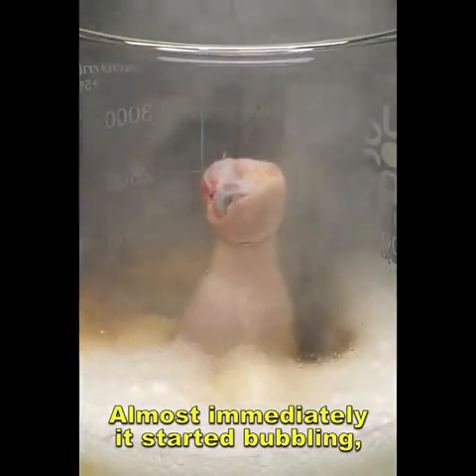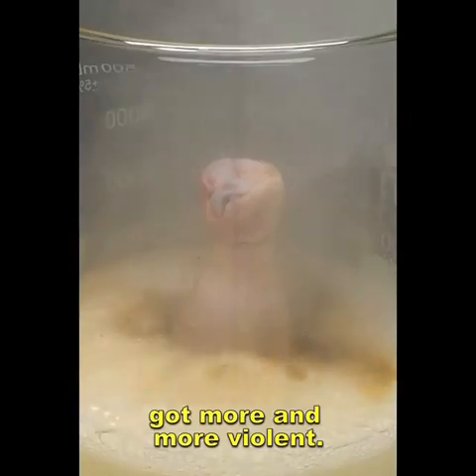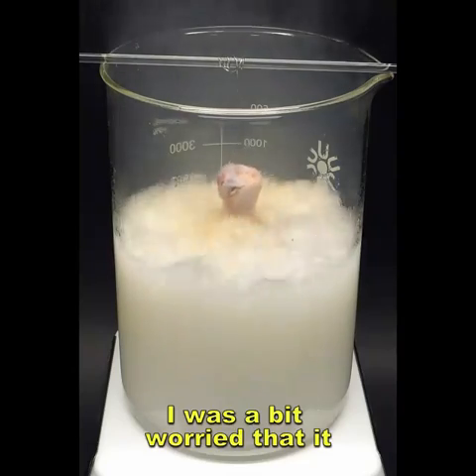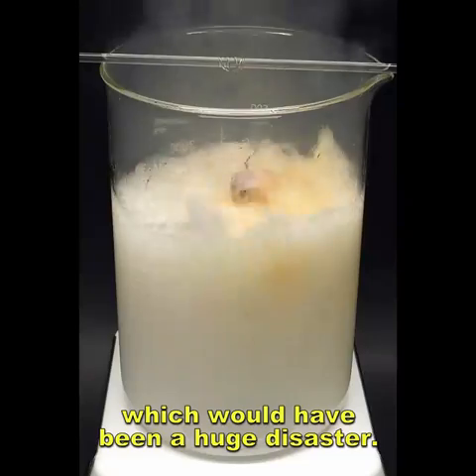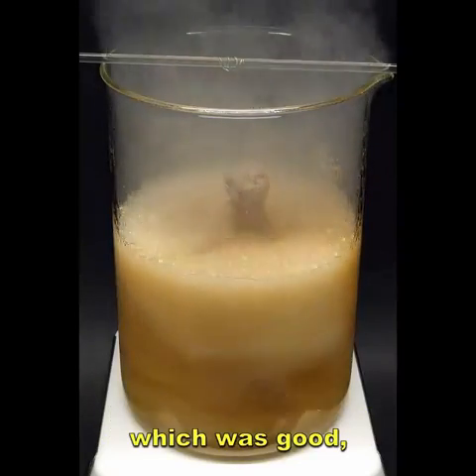Almost immediately it started bubbling, and the reaction slowly got more and more violent. I was a bit worried that it would spill out of the beaker, which would have been a huge disaster. It thankfully started calming down, which was good.